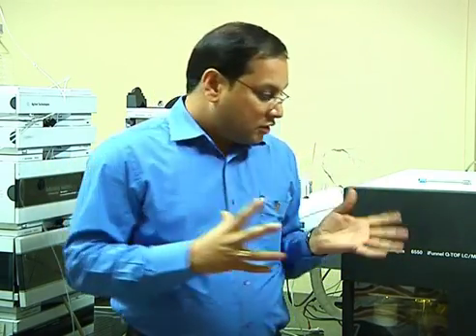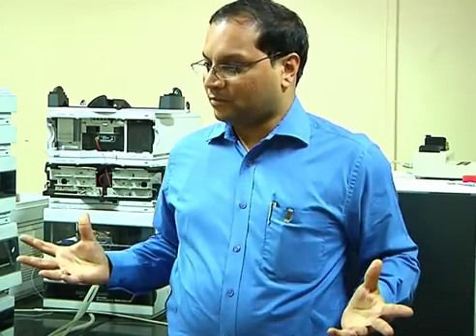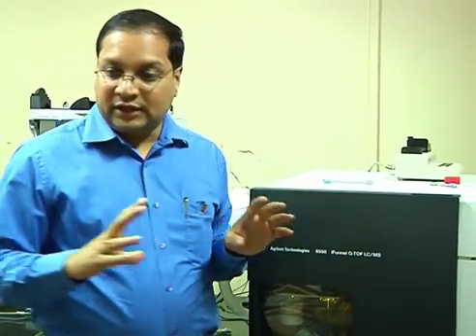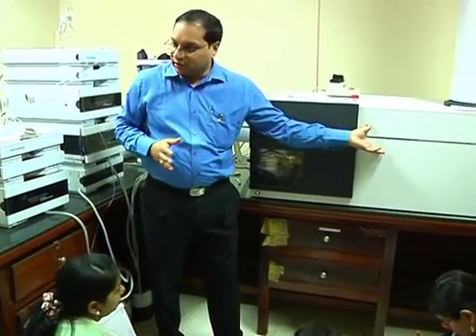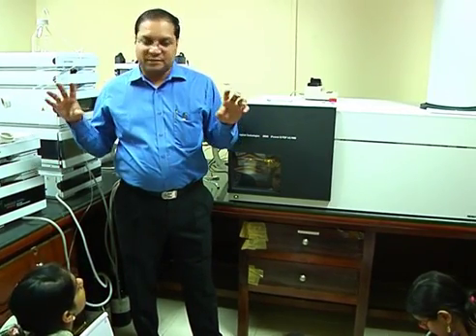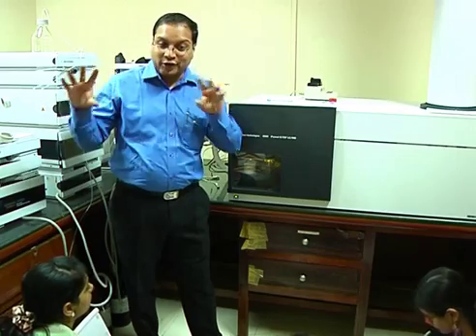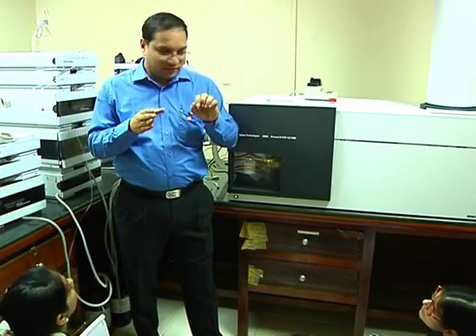You have heard the name called triple quad. Quadrupole, collision cell, another quadrupole. Instead of time of flight, if you put another quadrupole, it becomes triple quadrupole. And when you have two mass analyzers with the functionality of an MS in the form of a collision cell, you call them tandem MS, because they are talking to each other. They are in tandem with MS in between.